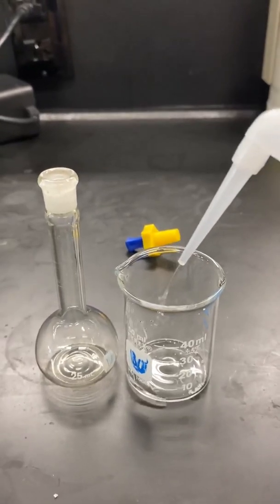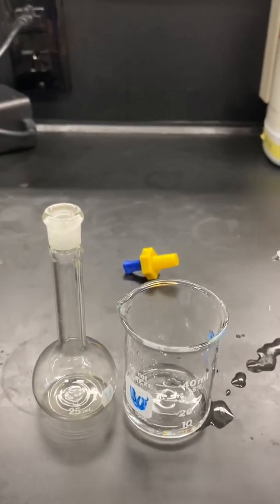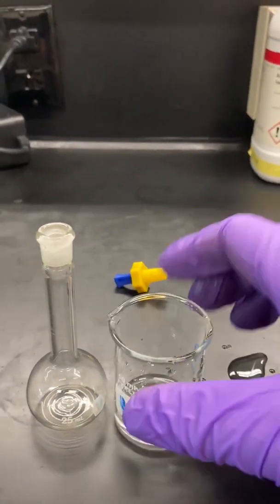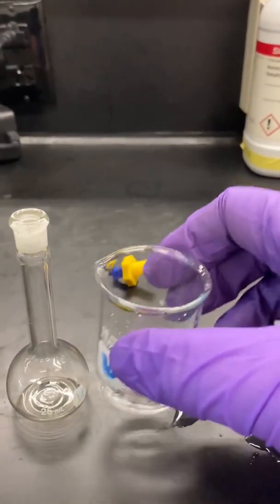Using some distilled water from your squirt bottle, dissolve the solid and transfer it to a 25-milliliter volumetric flask.